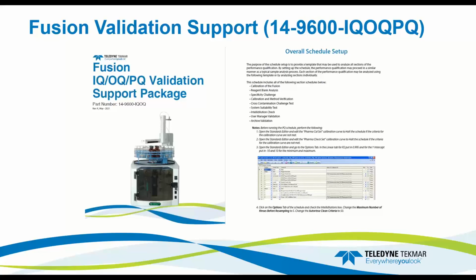So in conclusion, there is another option out there for cleaning validation, and it is TOC. TOC does provide a lot of different advantages that HPLC may not be able to provide you instantaneously.